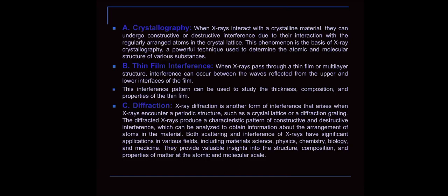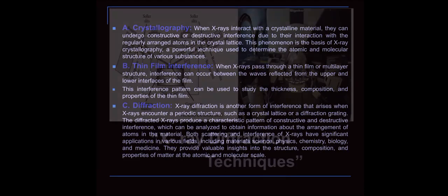Both scattering and interference of X-rays have significant applications in various fields, including material science, physics, chemistry, biology, and medicine. They provide valuable insight into the structure, composition, and properties of matter at the atomic and molecular scale.